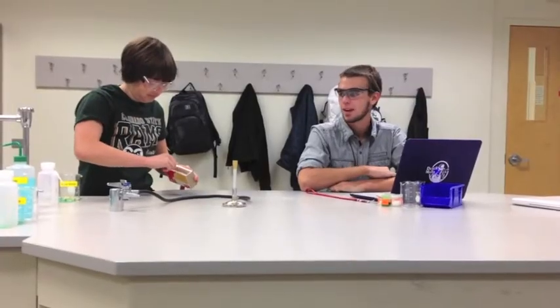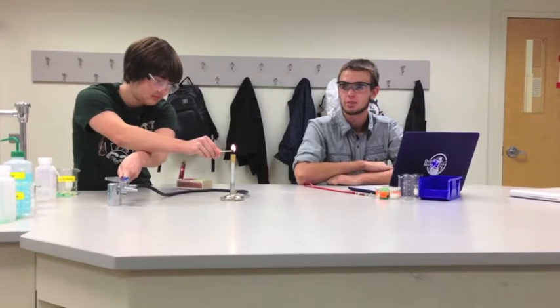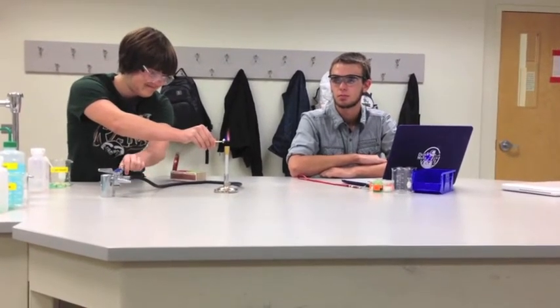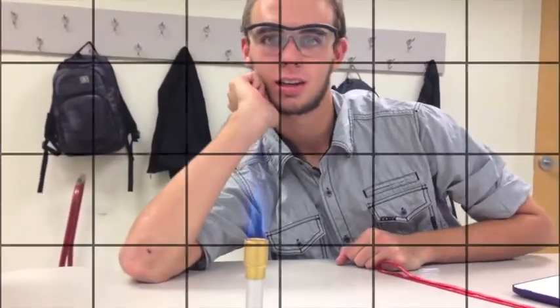Next, you need to light your match or lighter and place it over the burner tube. You might need to adjust your gas or collar to get the flame to light. This is what your blue conical flame should look like.